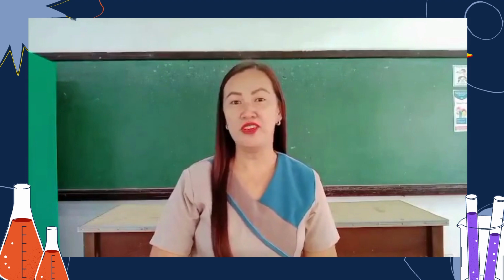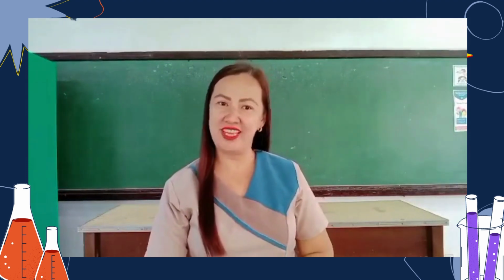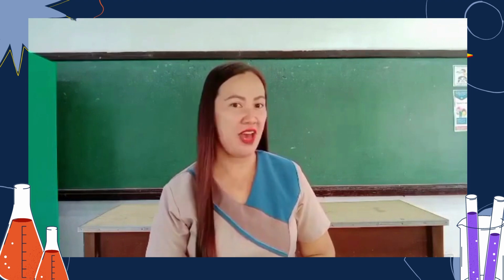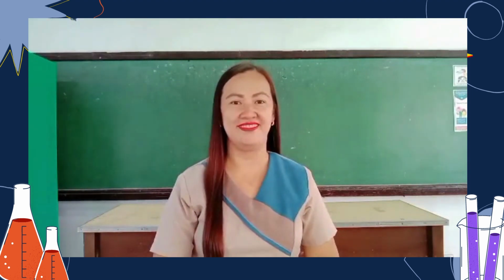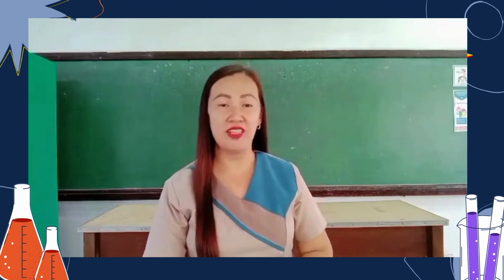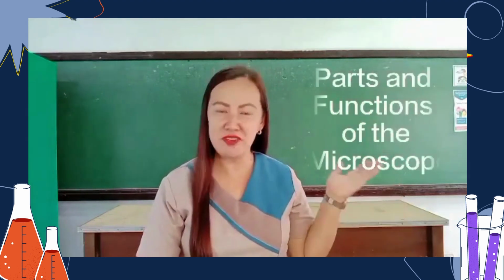Now, what do you think would be our topic for today based on the activity that we had? Do you have any idea? Yes, it's correct. It's all about the parts and functions of the microscope.